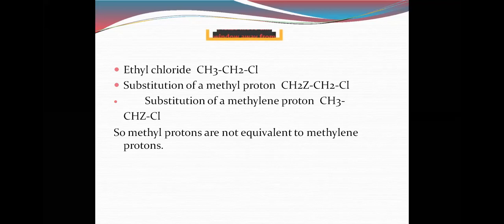One type of proton is 2, another type of proton is 3. Similar protons in the methyl group number 3, and similar protons in the methylene group number 2.